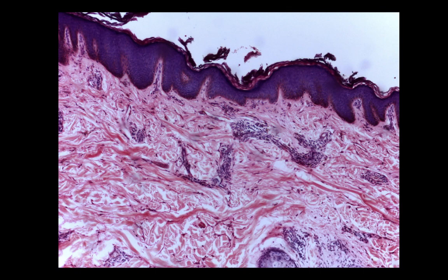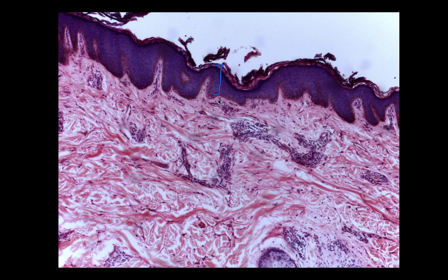Let's see where we can find areolar connective tissue. This is actually a slide of the scalp. Up here we see the epidermis, which is that stratified squamous epithelial tissue. And then all of this down here would be the dermis, which is made up of connective tissue. Up here looks kind of very fine and delicate, and that is actually going to be the areolar connective tissue — it's called, if you've had the integumentary unit, the papillary layer.